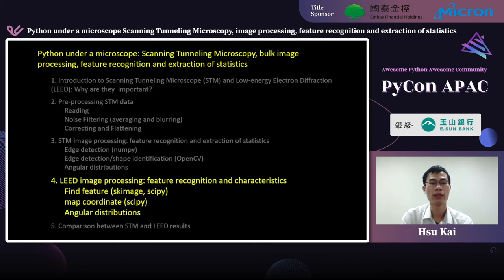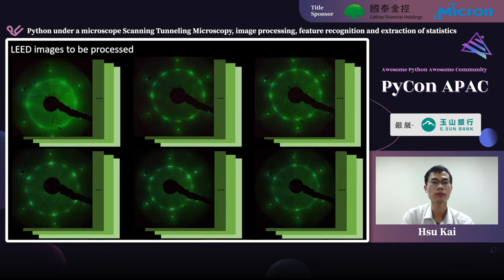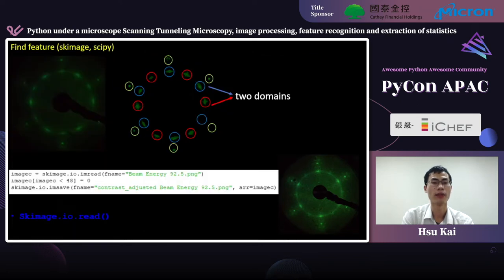Okay, let's move on to the next section, LEED image processing. Again, we have a bunch of LEED images. And within each of them, there are six outer spots, which correspond to substrate signals. And there are also 12 arc-like patterns on the inner ring. And we can also categorize these 12 arcs into two domains. Those six arcs, which align with those six outer spots, or having the same angular positions, they belong to 0 degree domain. And for all the others, they belong to 30 degree domain.